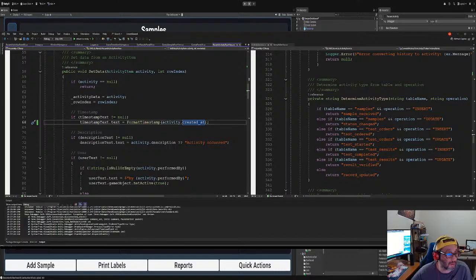So it works. Now we see our recent activities. What people want to see is the recent activities. The reason why I put recent activities is because when people first come in there, be it a lab tech or a doctor, they're gonna go in there and say, hey, what new samples are we working on? So they go here. That's the dashboard. That's the sample dashboard. That's the sample types. Actually, we should put that down below because we're not really gonna edit this all the time.